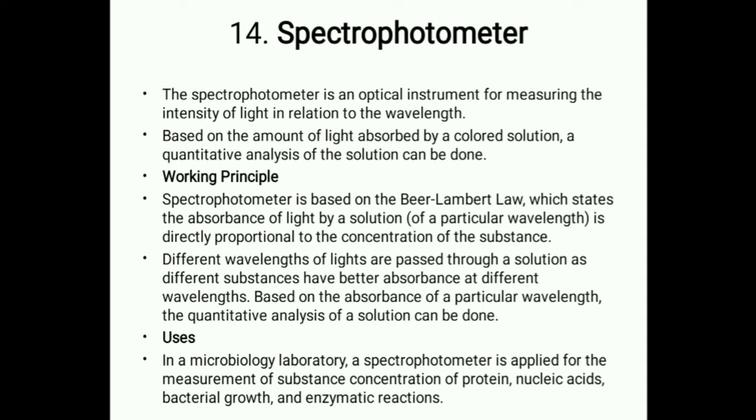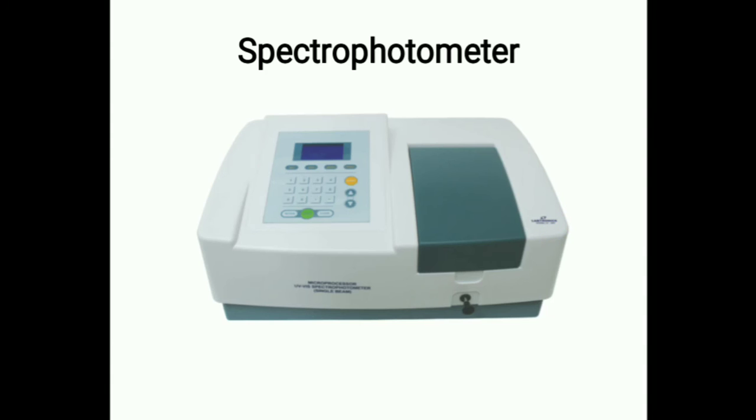Talking about the uses in the microbiology laboratories, a spectrophotometer is applied for the measurement of the substance concentration of protein, nucleic acid, bacterial growth, and enzymatic reactions. So this is a spectrophotometer.